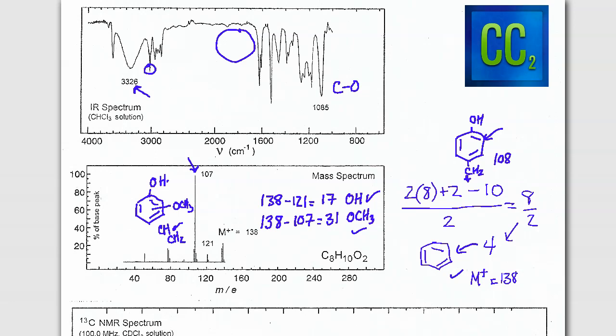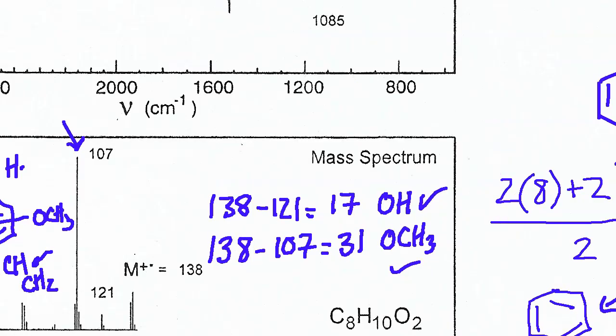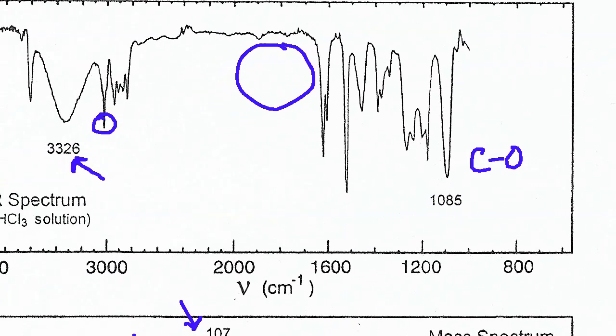and I might zoom in and out a little bit as we go through this. If we zoom in, that peak right there is just barely a hair over 3,000, and it's kind of drowned out by this alcohol peak. However, we do know that just north of the 3000 mark for wave number, we should start to see peaks that appear for aromatics. And so that would make sense as well. You also are going to find aromatic peaks right around here, even though those do not have a number or label on them right now.